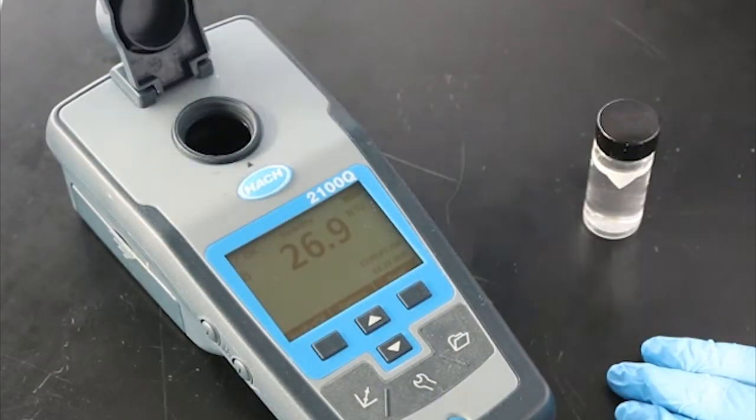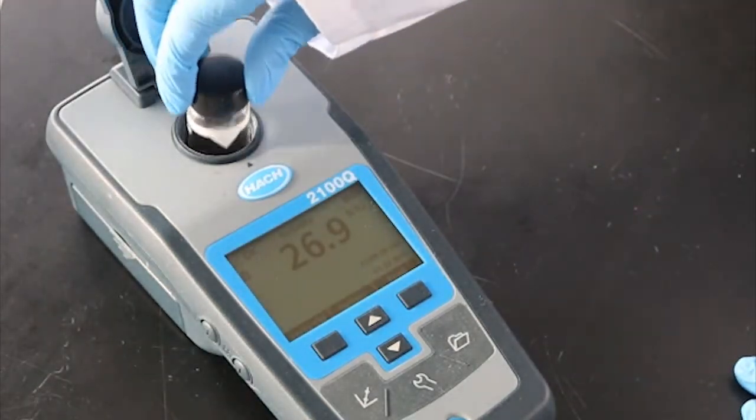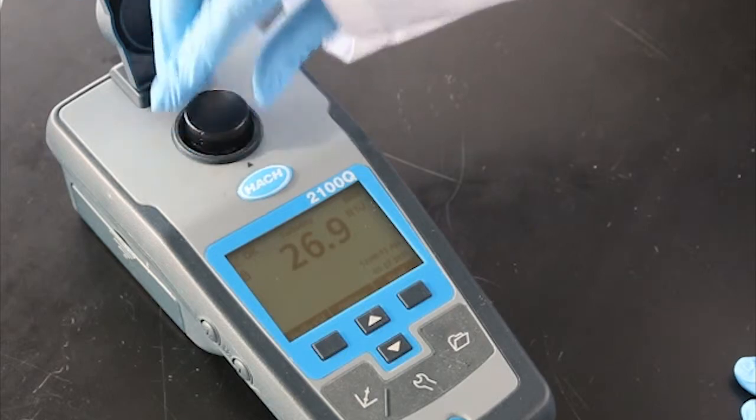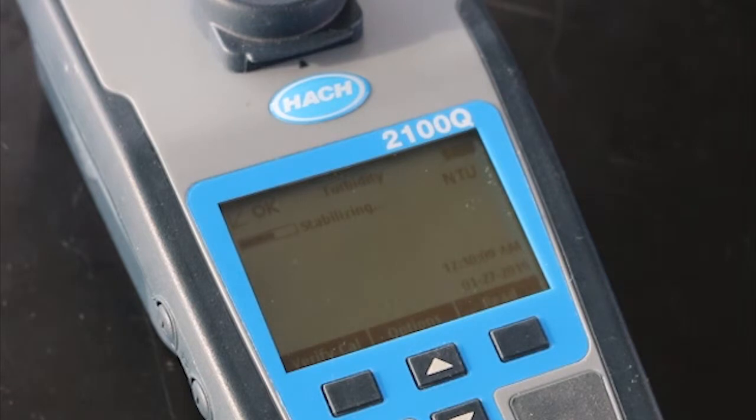Insert the cell into the cell compartment so that the orientation mark aligns with the one on the instrument. Close the instrument lid. Press read. The instrument will stabilize and show a turbidity result in NTU or nephilometric turbidity units.